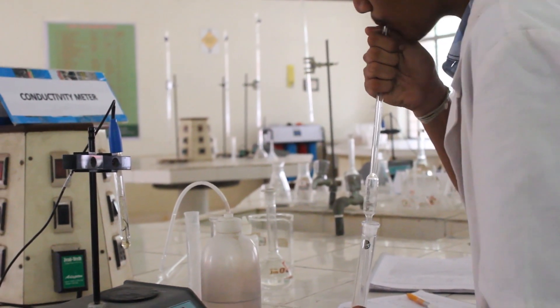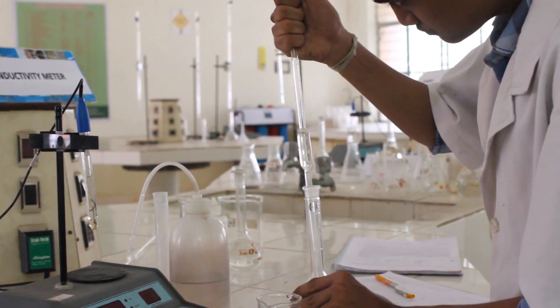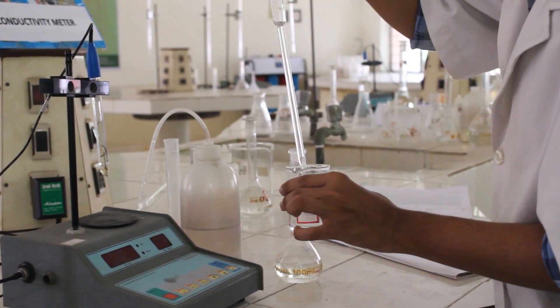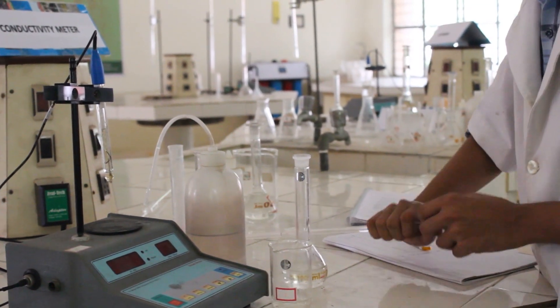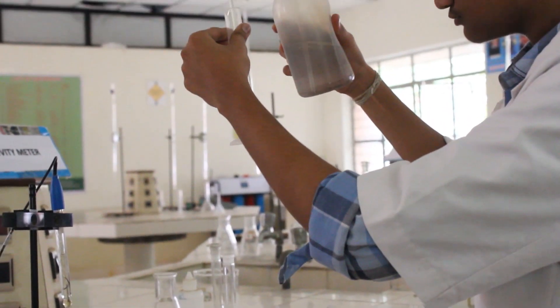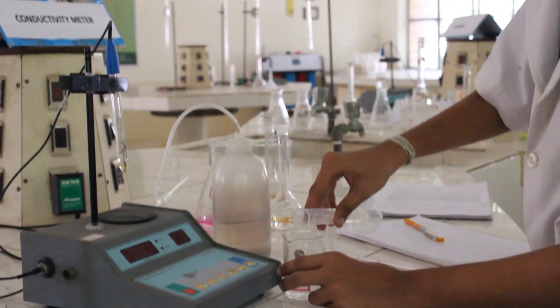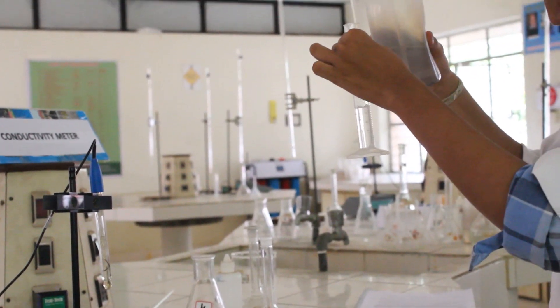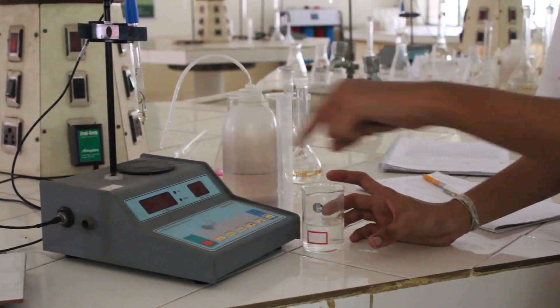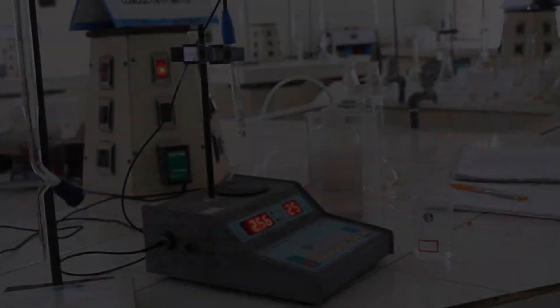Now the given unknown test sample solution of strong acid is made up to the mark using distilled water, and 10 ml of the test sample solution is transferred into a 100 ml beaker. To this, add 40 ml of distilled water using a measuring cylinder.